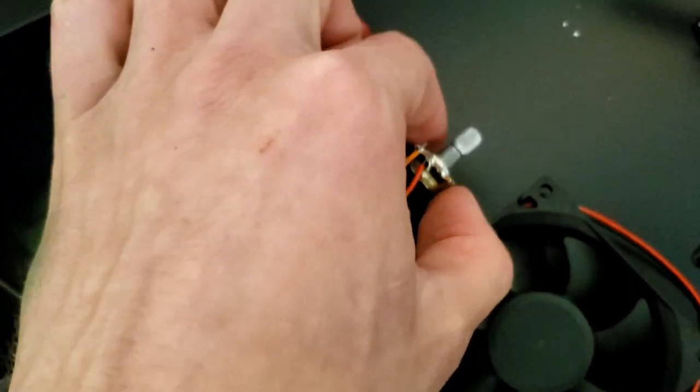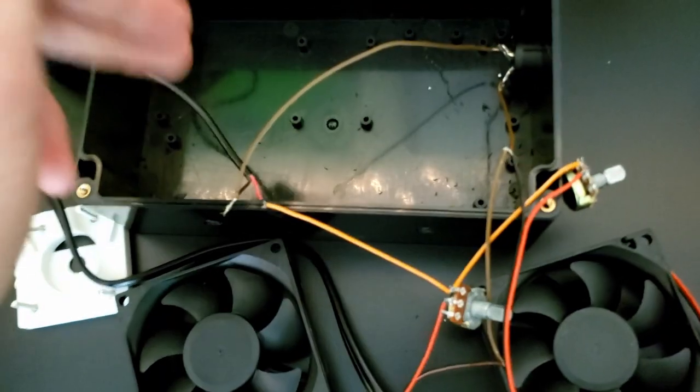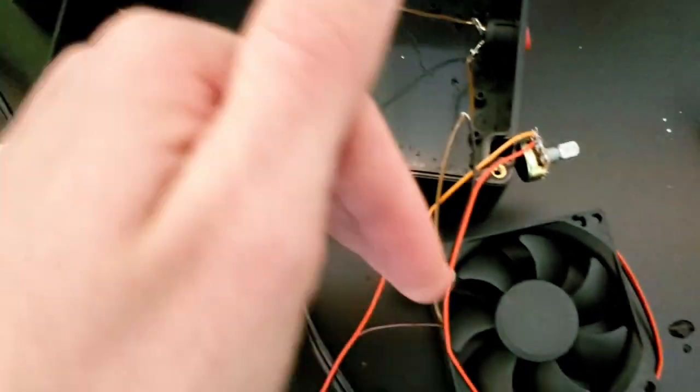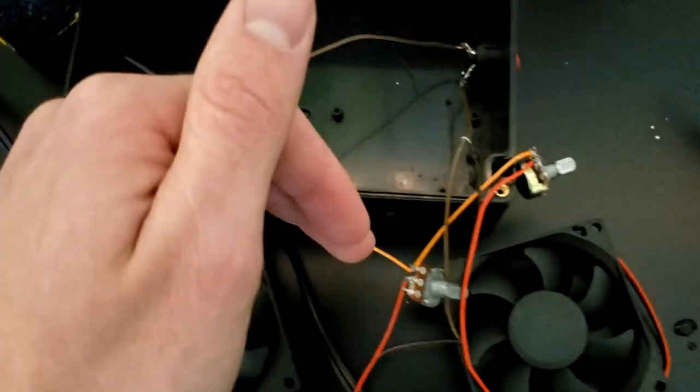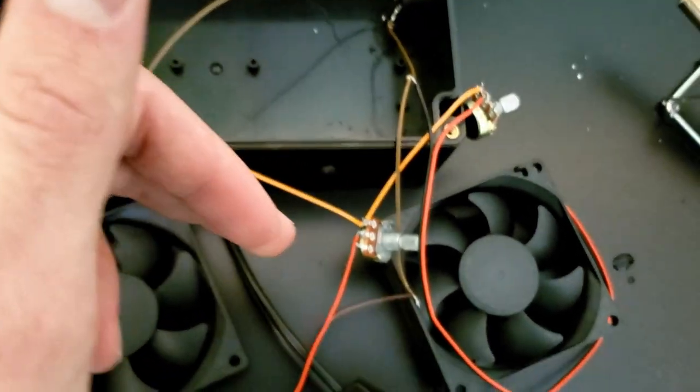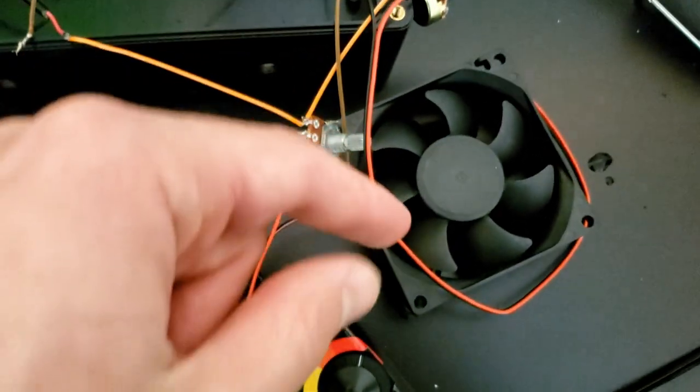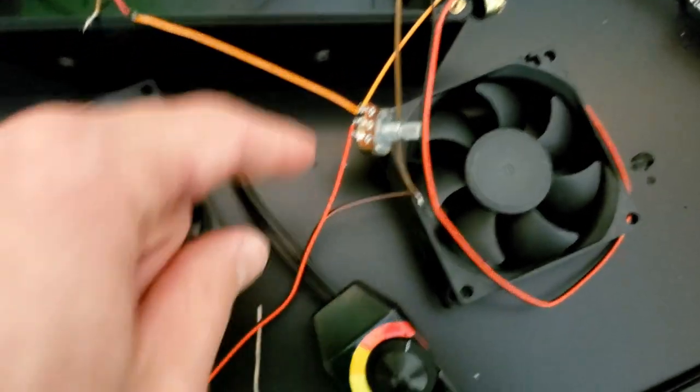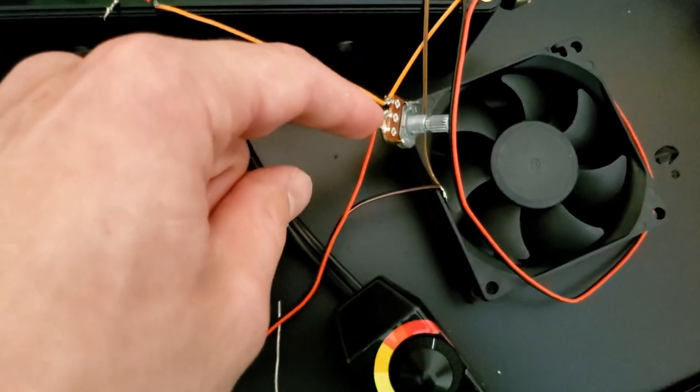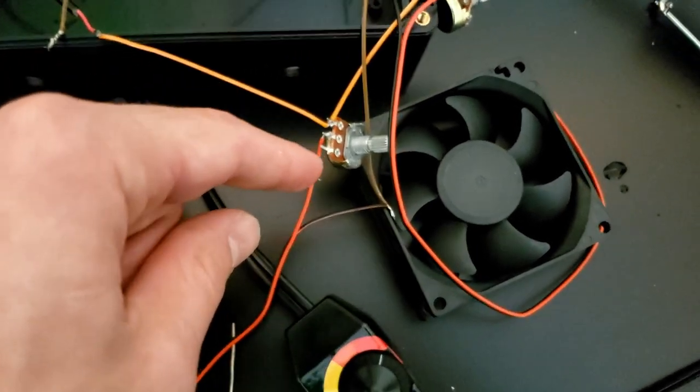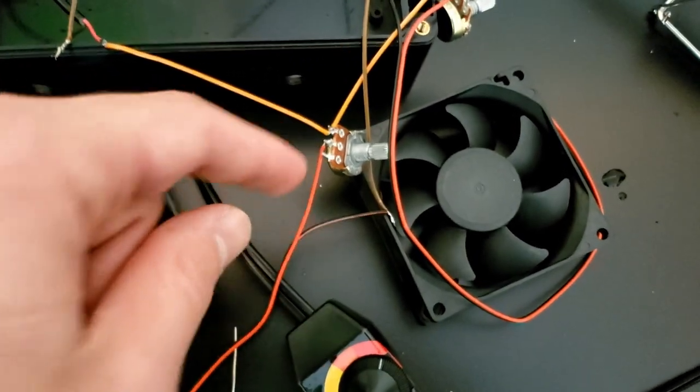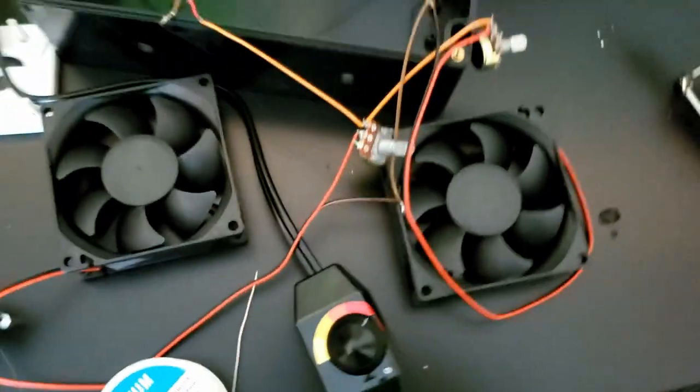The first pin there is to the orange wire. So the power at the 12 volts from the wall is connected to the first pin on both of those potentiometers. And then the power wire from the fan is going to the middle of the potentiometer. And the third prong isn't used.